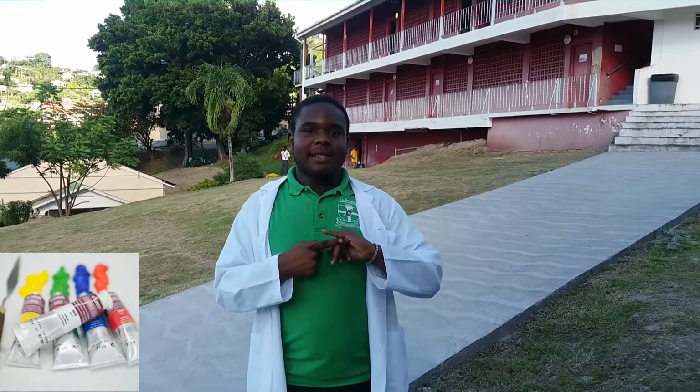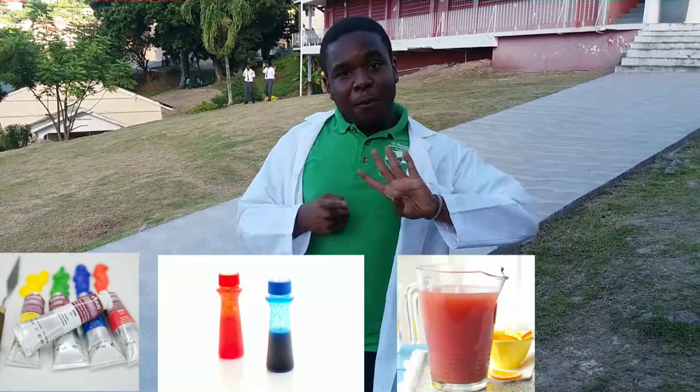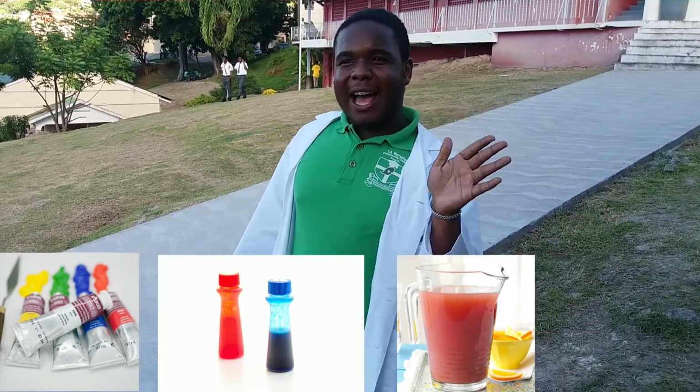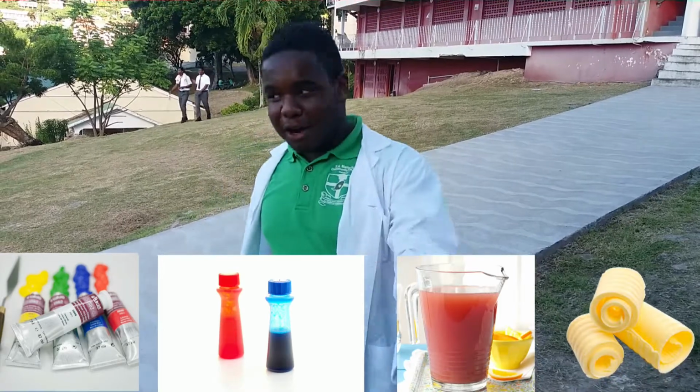So you're presented in front of us here. We had oil paints, we had red food coloring, blue food coloring, fruit punch, and what was that final ingredient? Yes, golden butter. Yeah, we're low on funds.